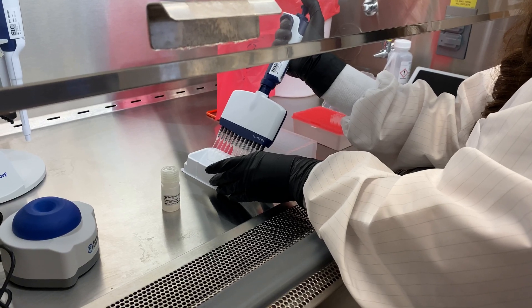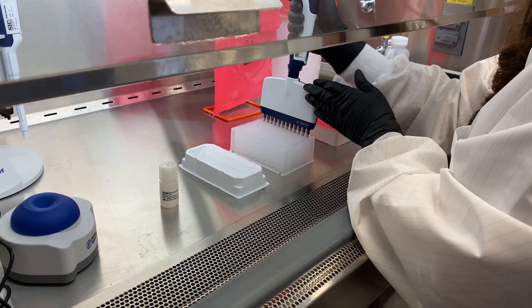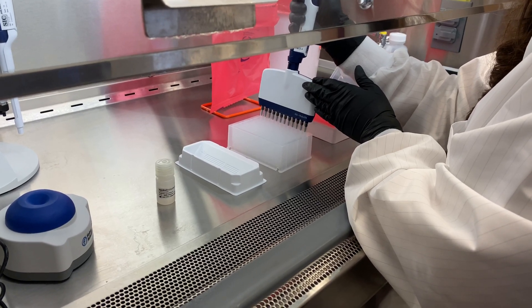The positive control is a separate reagent that does not go through extraction. Therefore, well 12H can be ignored.